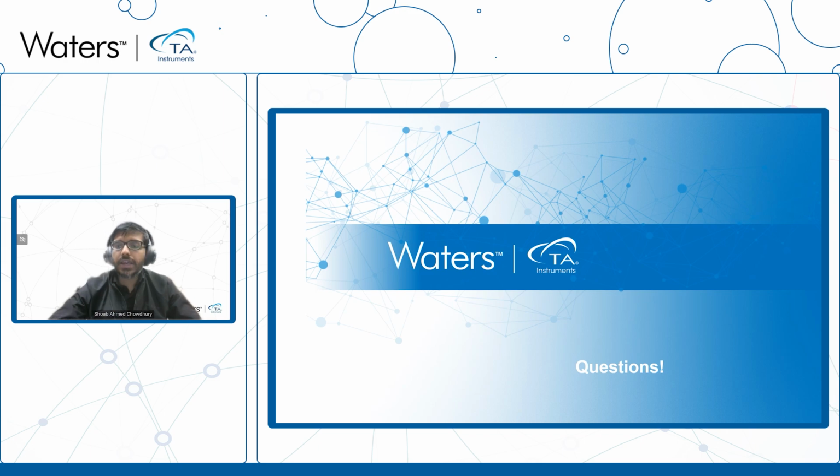But you can select a storage modulus, onset of storage modulus, or even a peak of tan delta to define your glass transition temperature. It can vary from application to application, but the most important thing is, once you select one definition for your glass transition temperature, you stay consistent with that definition for your subsequent testings as well. Okay, thank you.